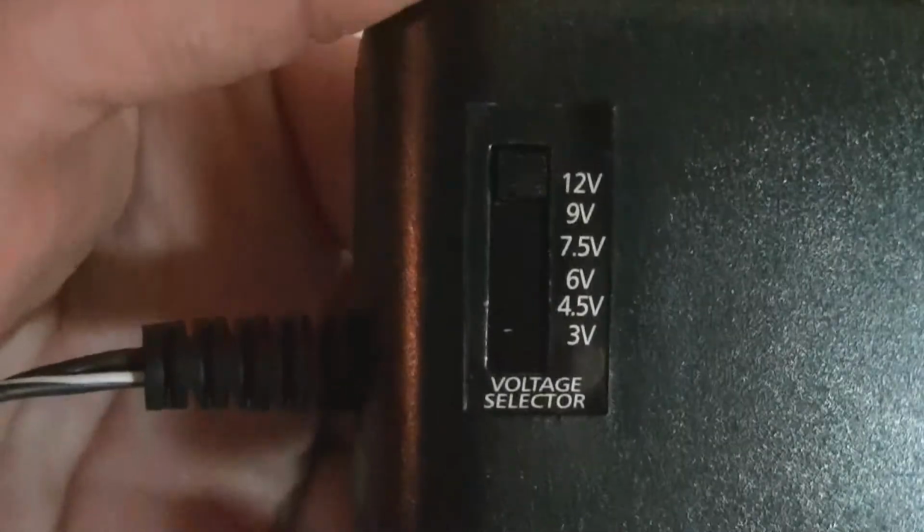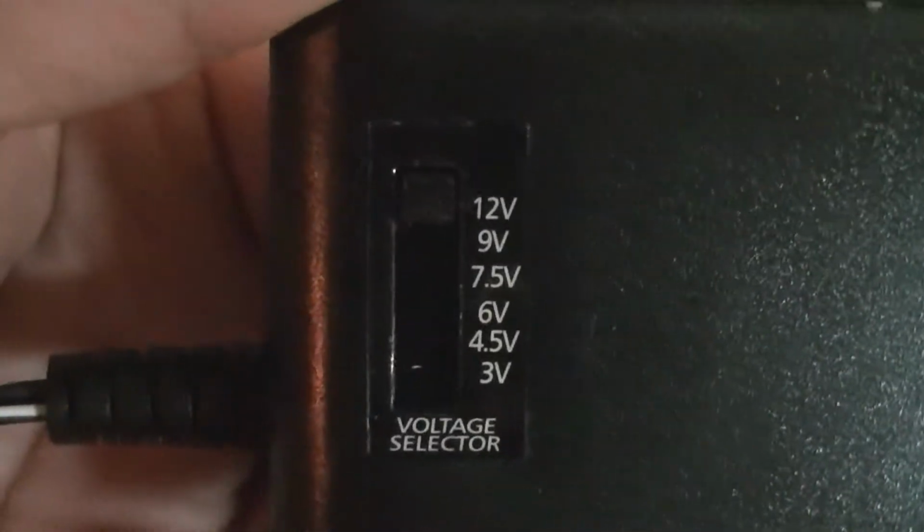Doesn't quite work, actually. I turn on the stir plate, the bar starts to spin, and it just must not be powerful enough, and it sends the bar flying off. But I've heard people using the smaller voltage power supplies and having good luck with it. Maybe it would have worked now that I have the stronger magnets on there, I don't know. But just, you know, cheapish power supply here.